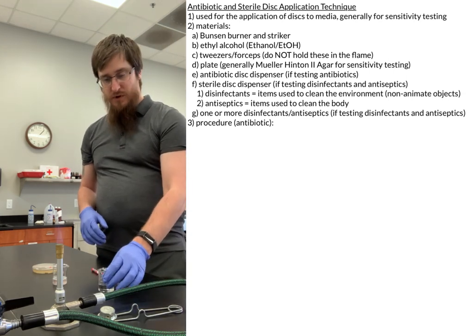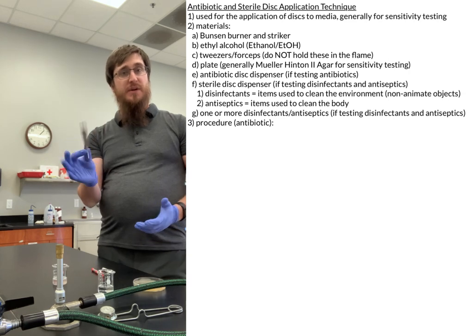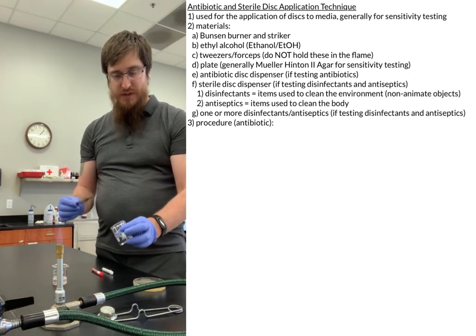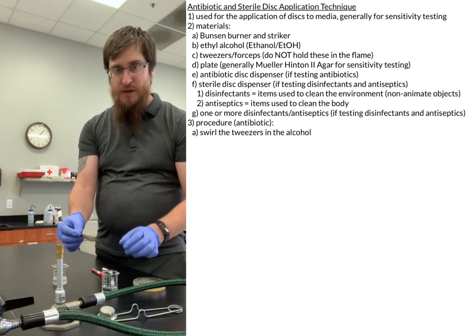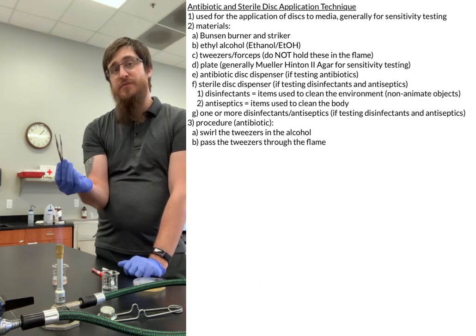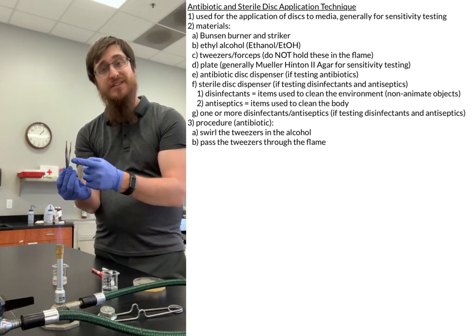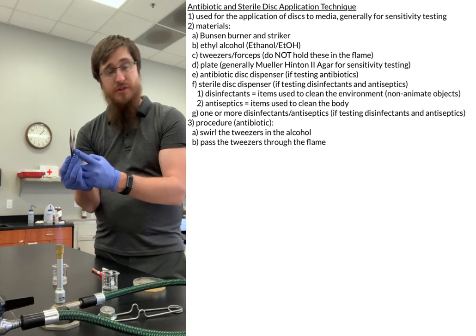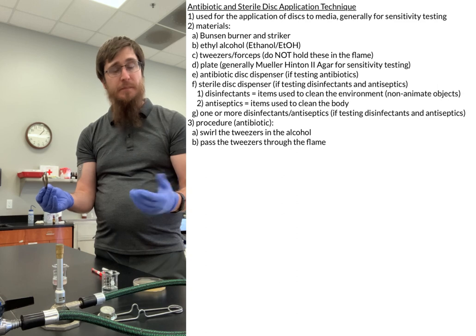Basically what we're going to start out with is we have to clean off our forceps. So we have to flame the forceps, or our tweezers, and the way that you do that is you'll dip them down into the ethyl alcohol, and then you're going to pass them through the flame so that they catch on fire. And this is very important. Only pass them through the flame. Do not hold them. This is a metal that conducts heat, so it's going to get hot really fast, and then you can burn your hands. So only pass it through the flame, and then we're good to go.